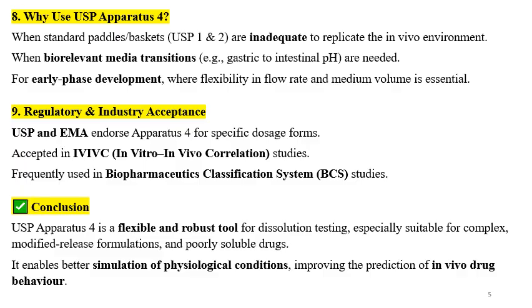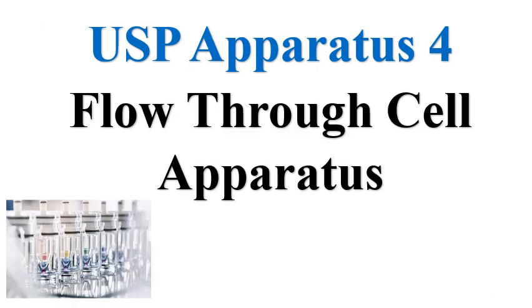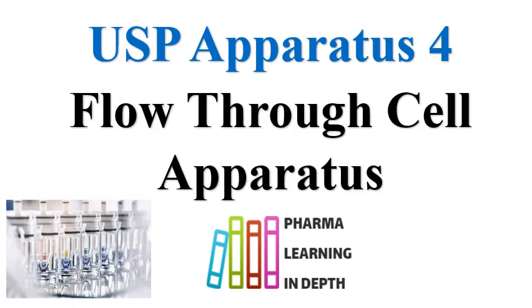Also, some formulations are not disintegrating in nature. For those, this apparatus is suitable. It enables better simulation of physiological conditions, improving the prediction of in vivo drug behavior. For these reasons, the USP 4 apparatus is suitable and can be used.